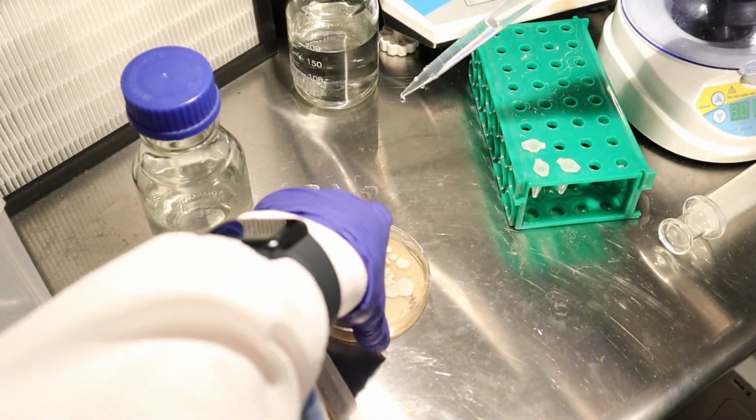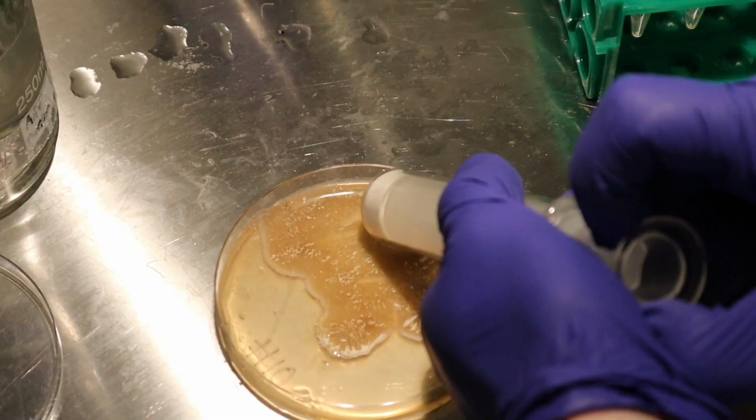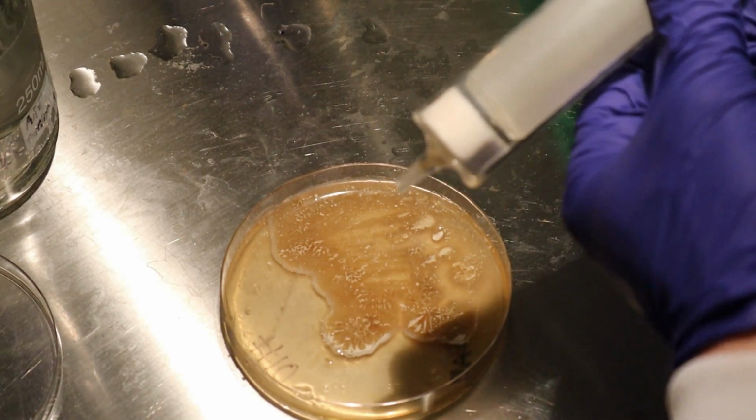If I filtered out just the spores, if anything grew at all, then we knew it was Streptomyces, because if there were no spores, then I would have filtered out nothing. I was supposed to put 5 milliliters of sterile distilled water over the bacterial lawn, mix it together with a sterile swab, and then filter it through what it referred to as an autoclaved wad of cotton in a syringe.